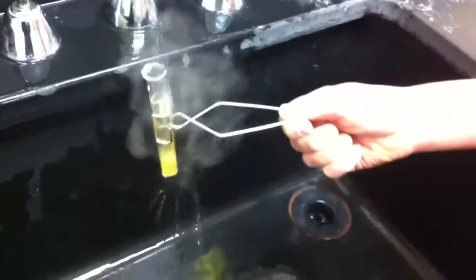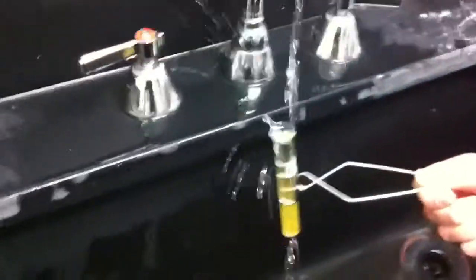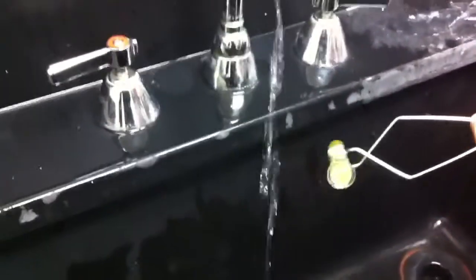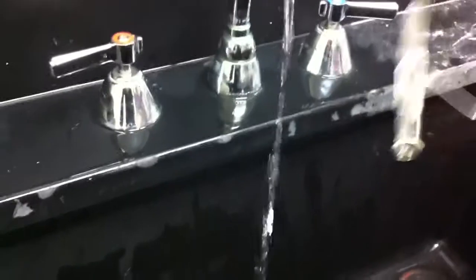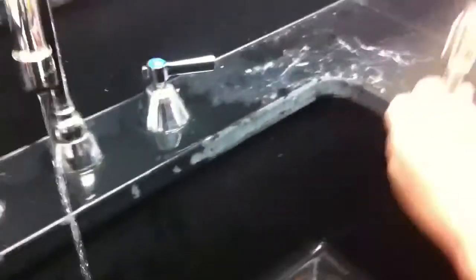Rejected. Alright, over here. Let's see what this can do. One, two, three. Oh! Dump it out. Let's use a different one. Different test tube? Yeah, what is this? What is it?